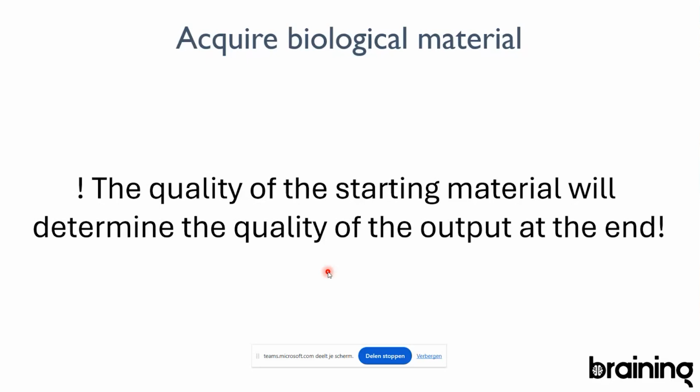If you have a sample where all your RNA is already fragmented because you did not keep it on ice, it means that at the end you can do long-read sequencing, but if you have fragmented RNA, you will not have long reads, right? So be very careful with the quality of the material that you start with.